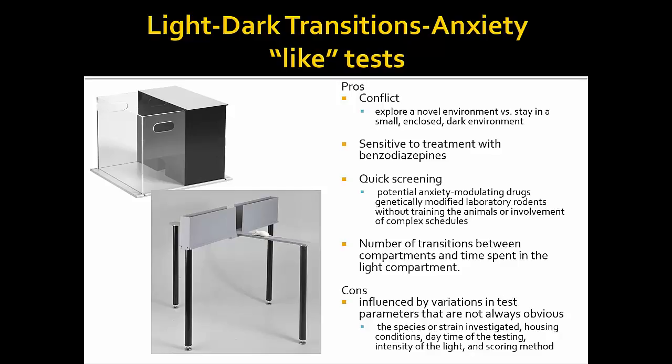And so those were sort of basic tests of interfering with motor coordination. In rodents, you can also do multiple anxiety-like tests. Two of the ones that I'm very familiar with are the light-dark box and the elevated plus maze. Both of these give the animal a conflict because they're very curious animals. So they want to explore and see what kind of environment they're in. But they also want to stay in these dark, closed areas because they are prey animals. If they stay in the closed, dark area, they're not going to get eaten by something.